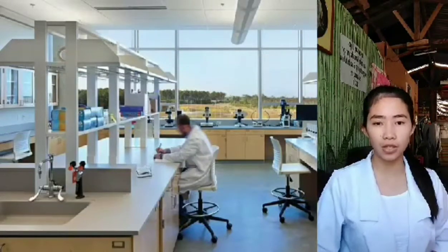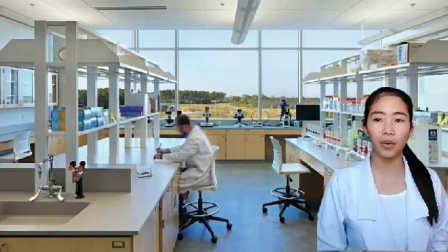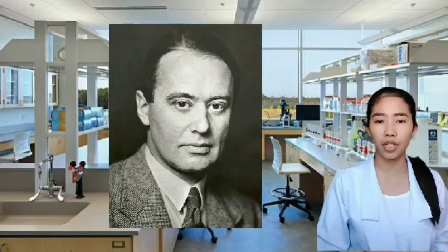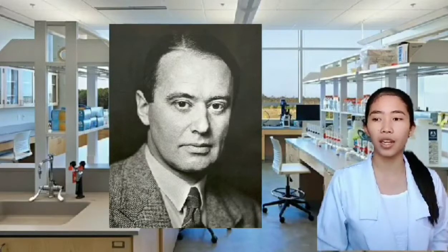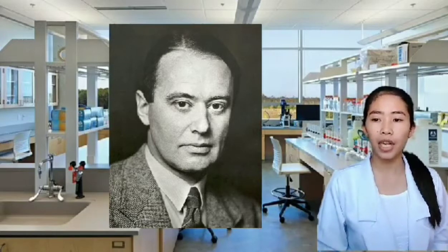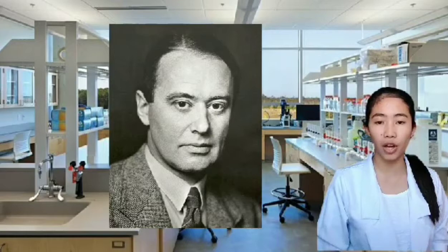So let's proceed to the history of gas chromatography. In the early 1900s, chromatography was discovered by Mikhail Semyonovich Tswett as a separation technique to separate compounds. In organic chemistry, liquid-solid column chromatography is often used to separate organic compounds in solution. Among the various types of gas chromatography, gas-liquid chromatography is the method most commonly used to separate organic compounds. The combination of gas chromatography and mass spectrometry is an invaluable tool in the identification of molecules.